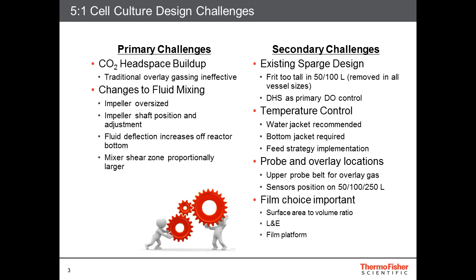Depending on the cell line, there could be varying amounts of carbon dioxide buildup, but it will have a significant impact on the whole cell culture process because it reacts with your culture and creates an acidic environment, which can have a severe effect on the growth and viability of cells.